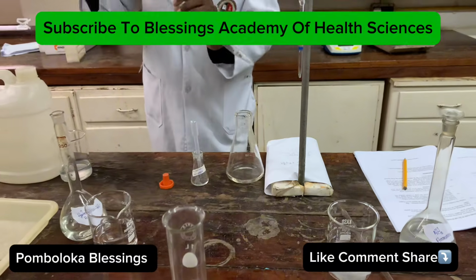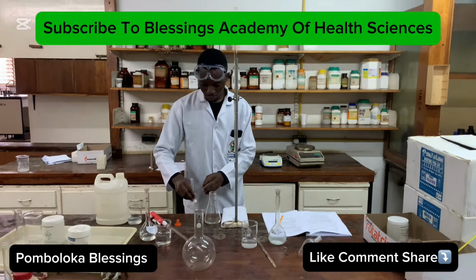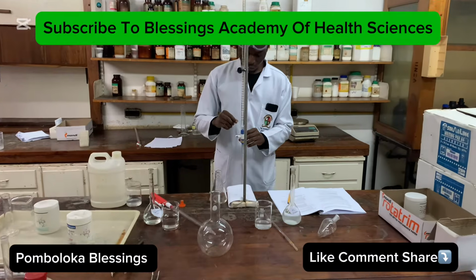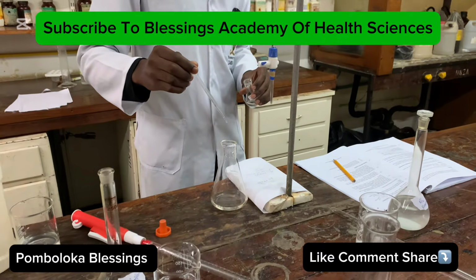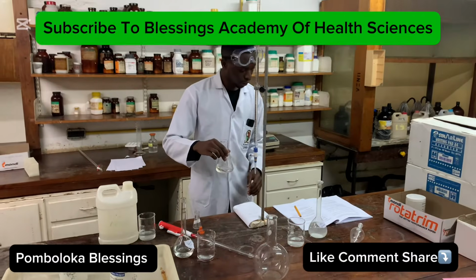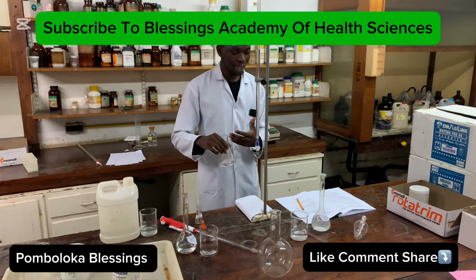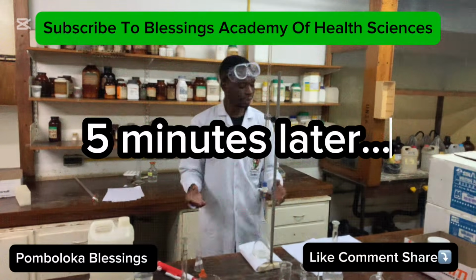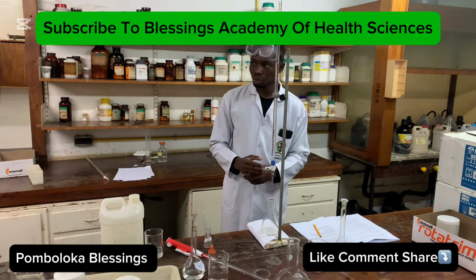All right. So we've mixed the reaction, the ammonia plus the HCl. So the second part of the procedure, we're adding 2 to 3 drops of the indicator, phenolphthalein. 2 to 3 drops. 1, 2, 3. Then we're mixing slightly. Allow the mixture to react for about 5 minutes by shaking the flask slightly. All right, so we've allowed this one to mix for 5 minutes.